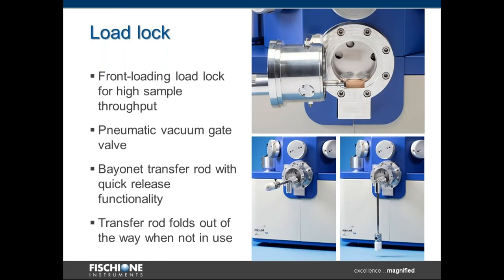The try-on mill features a front-loading load lock, and this is an ideal situation for high-throughput sample flow. A pneumatic gate valve separates the load lock from the instrument chamber, which is always under vacuum. With this system, we have a quick-release quarter-turn bayonet located on the end of the transfer rod, which allows for easy engagement and disengagement of the sample holder. On the left, you can see the transfer rod in the loading or unloading position. When it's not being utilized, it folds down out of the way.